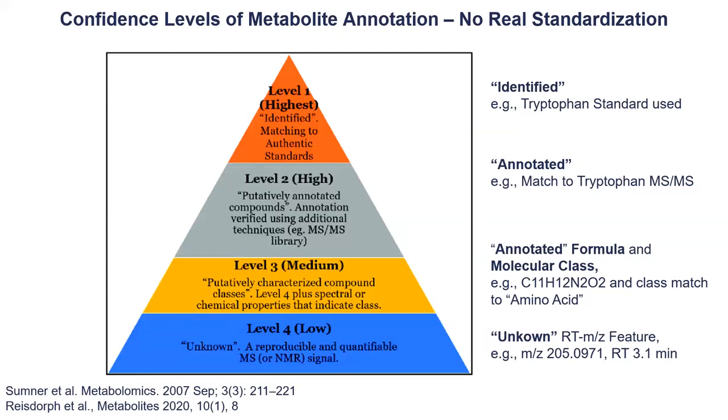If you have a plant sample or some natural sample, and then you have a synthetic compound in it, is it really the compound, or is it just something that might fragment similarly? So you need to really check, and not just say, okay, I have a very nice match, I have a high cosine similarity, and this is my compound. So always check the data, does it make sense, and maybe verify it in another way as well.